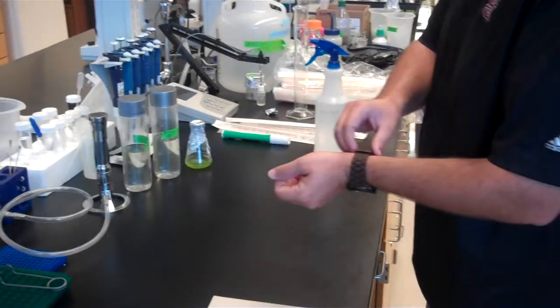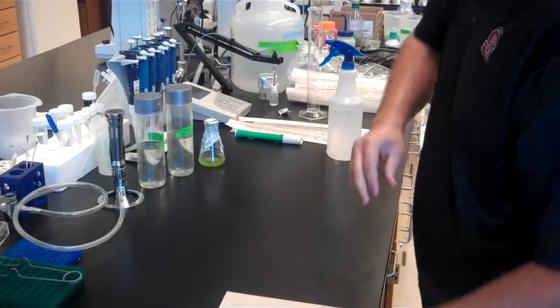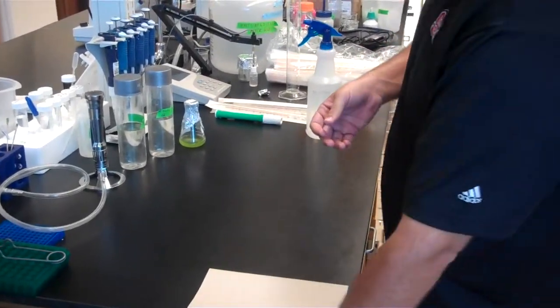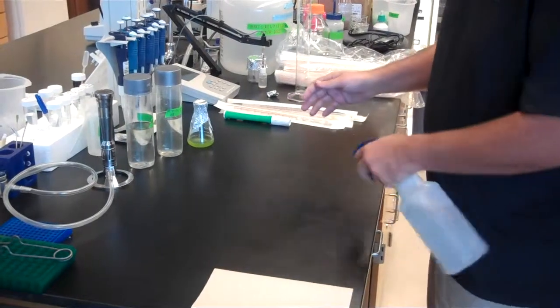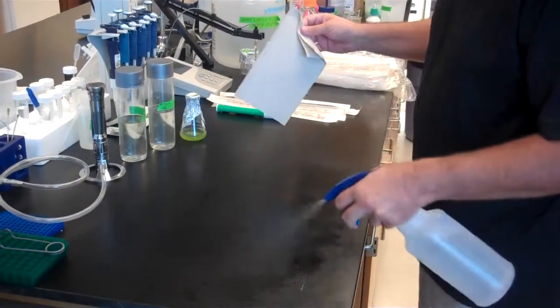And go. Okay, so the first thing I'm going to do is take off my watch and jewelry, because I'm using ethanol and we're around a flame and I don't want to mess up my watch and jewelry. So I'm going to spray the area down with 70% ethanol to help sterilize our ledge counter.